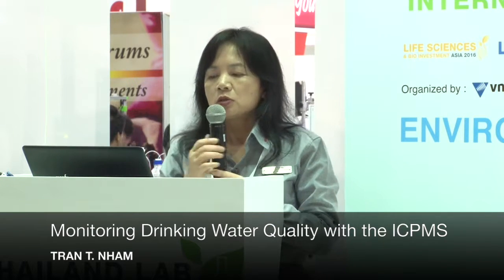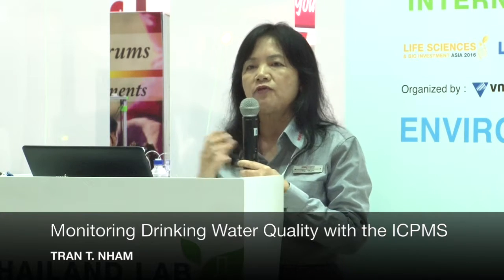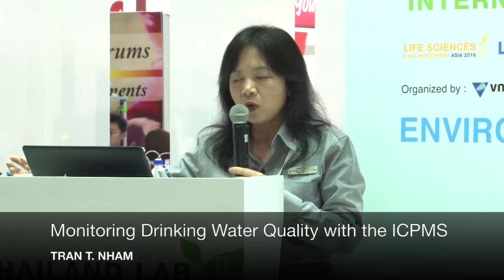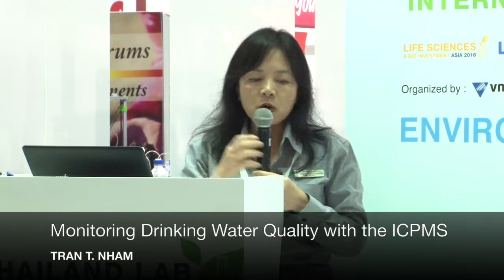Right. So the components of ICP-MS are very simple. There are 5 different components. Firstly, of course, most of the time the sample is in liquid form. Some samples could be solid, but they need different accessories. The liquid sample will go to a sample introduction system, and then to the plasma. Now, what is a plasma? The ICP plasma is generated by argon. So it's basically argon plasma.